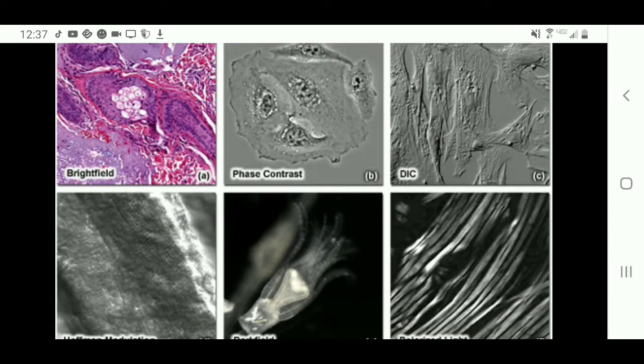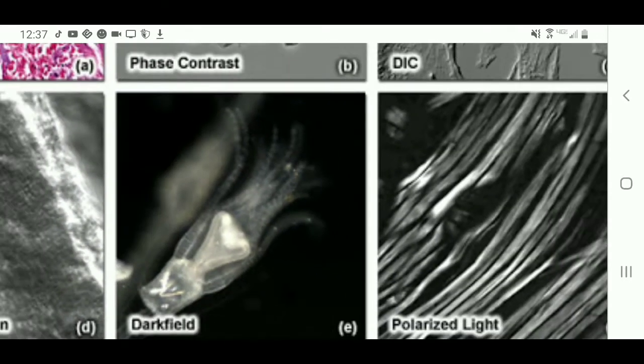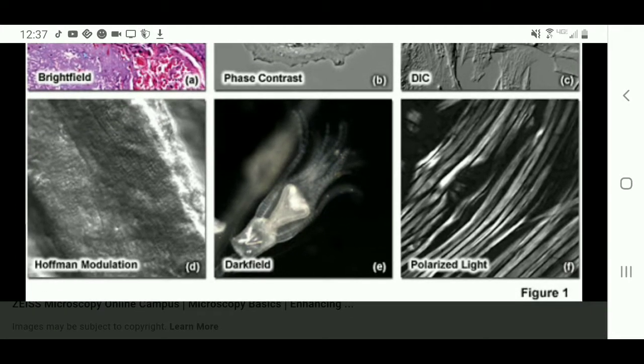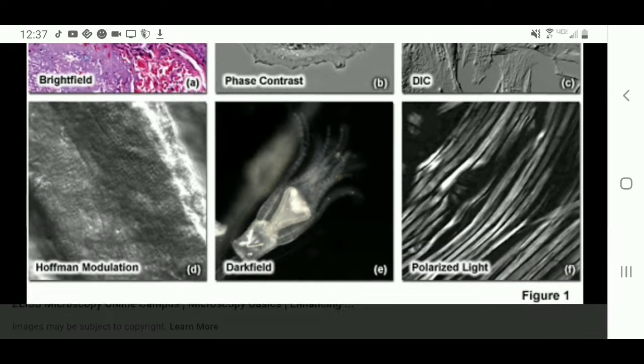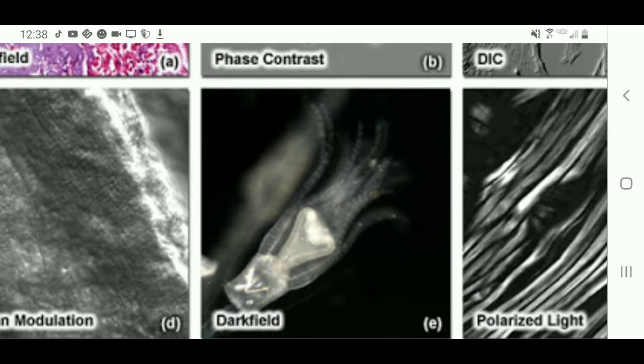I already managed to convert my bright field microscope into a polarized light microscope for a couple bucks and a couple of broken 3D glasses and electronic screens, with much more contrast. However, there are a couple other ways that I could increase the contrast even further, like converting it into a dark field microscope. Here is my polarized light dark field microscope.